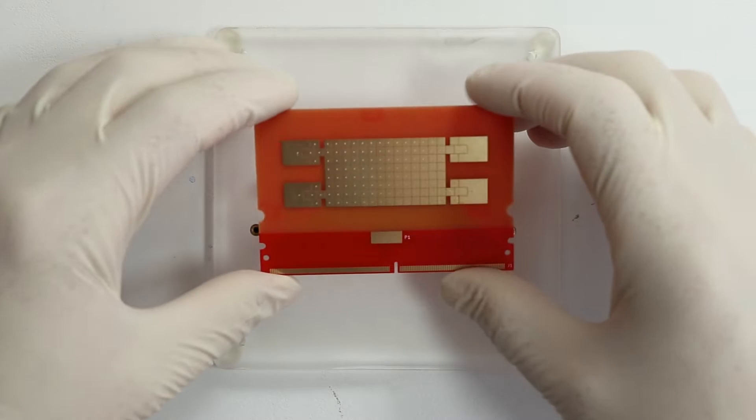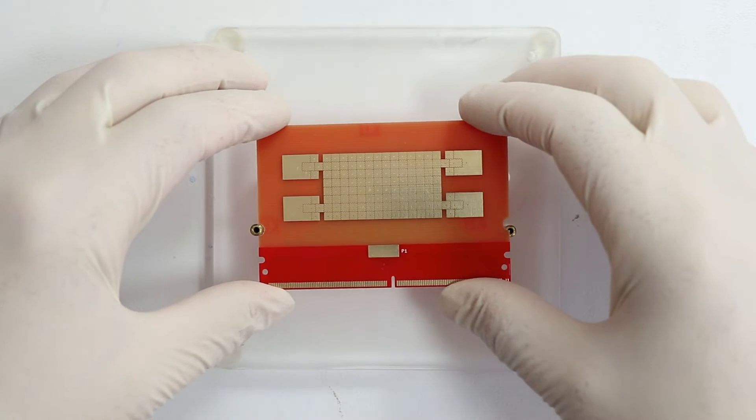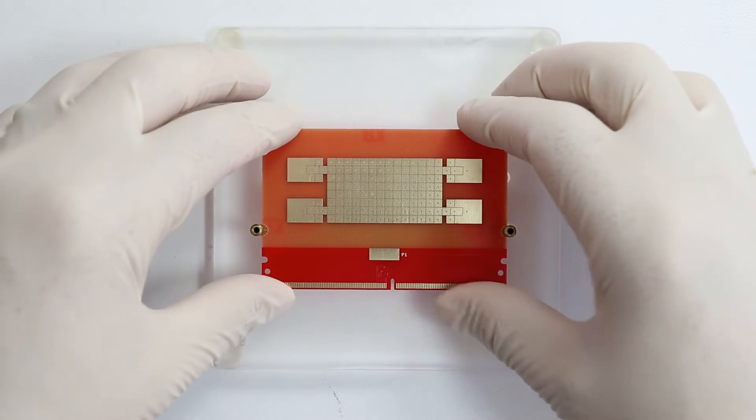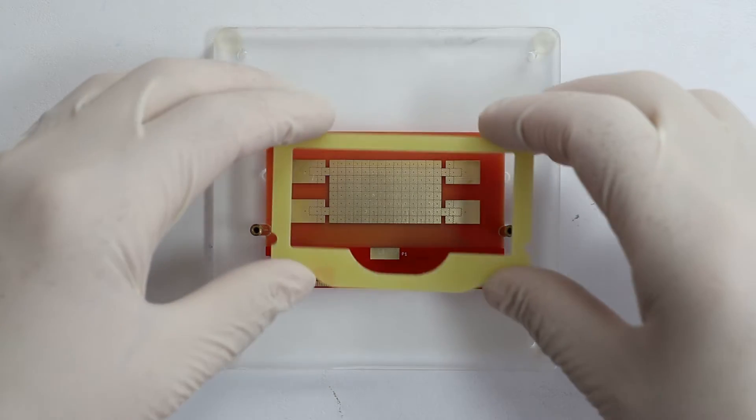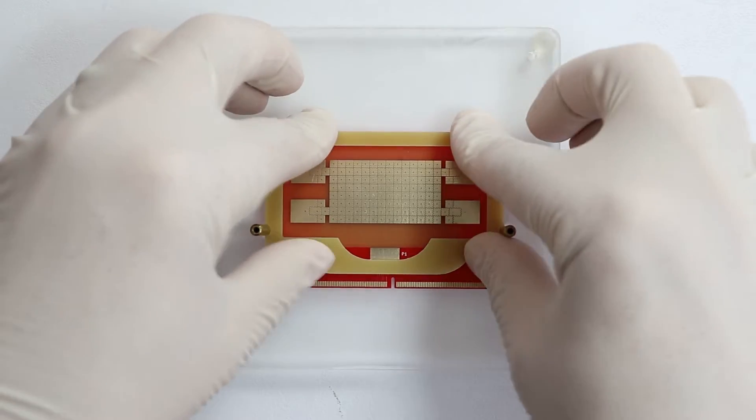The cartridge consists of a PCB with 128 gold coated electrodes arranged in an array. The PCB is laminated with an ETFE foil held by a spacer frame.